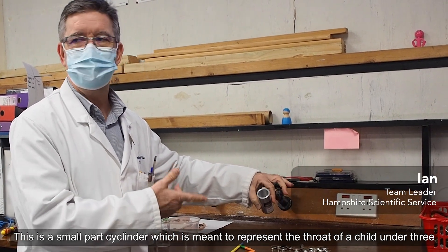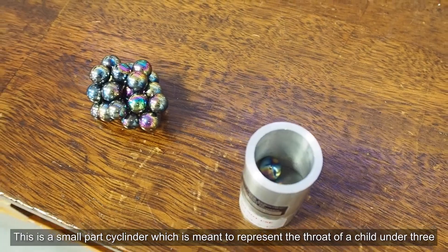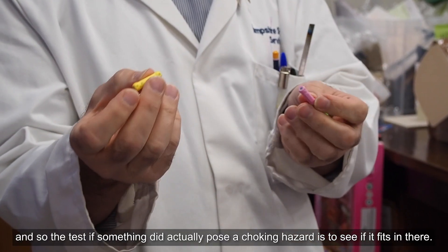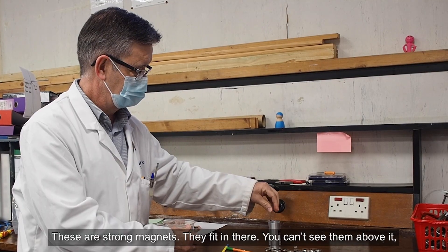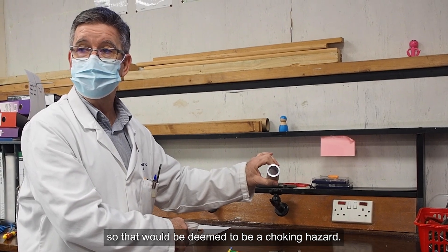This is a small part cylinder which is meant to represent the throat of a child under three. The test to see if something would actually pose a choking hazard is to see if it fits in there. These are strong magnets that fit in there and you can't see them above it, so that would be deemed to be a choking hazard.